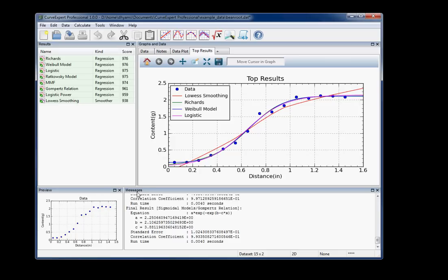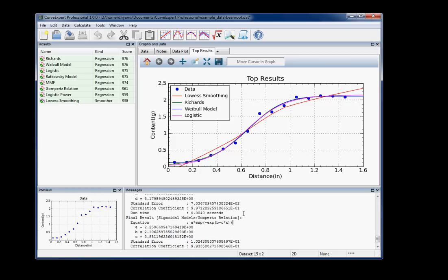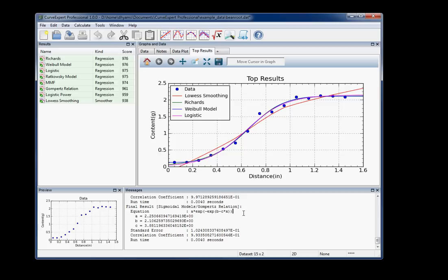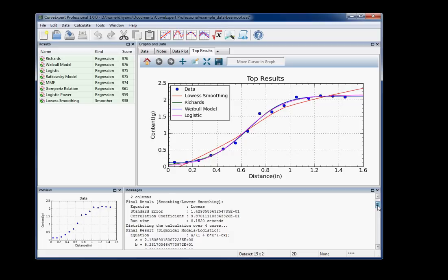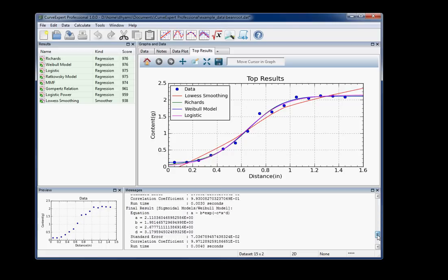And one window that I didn't get to down here was the Messages window, which shows you what CurveExpert happens to be wanting to communicate to you back at the time. Here, it just gives results of the different regressions that we just calculated.